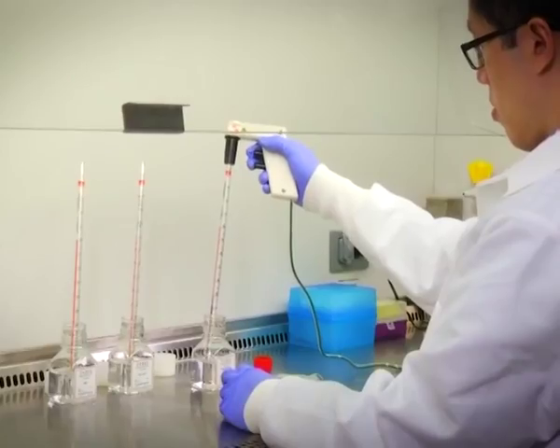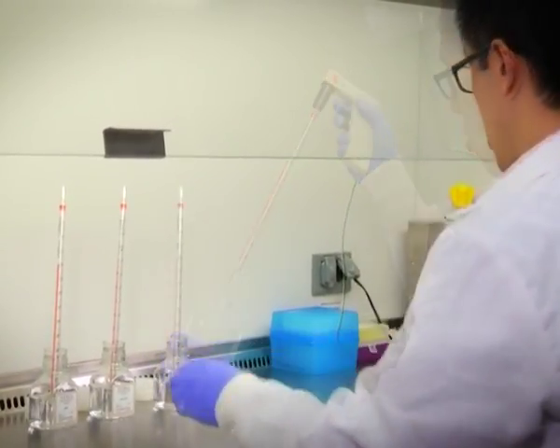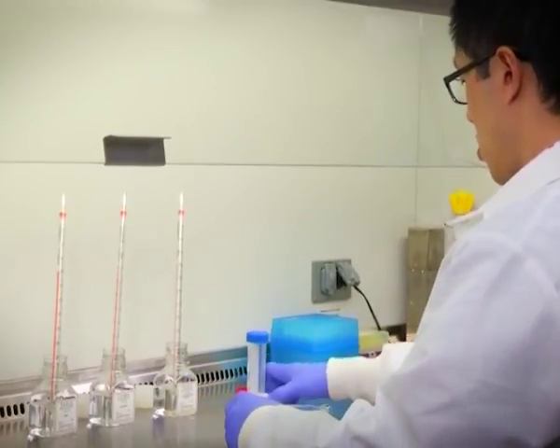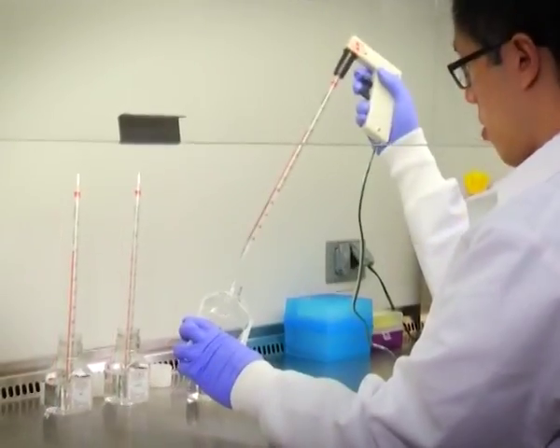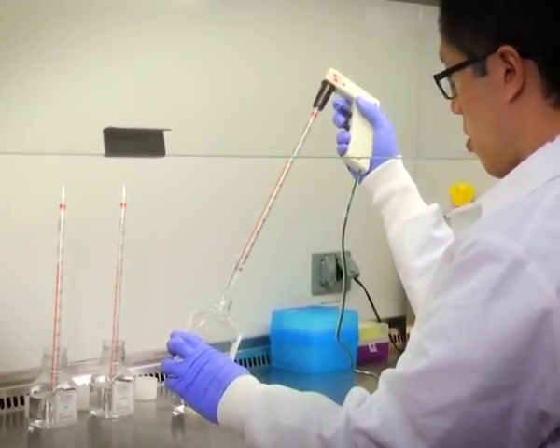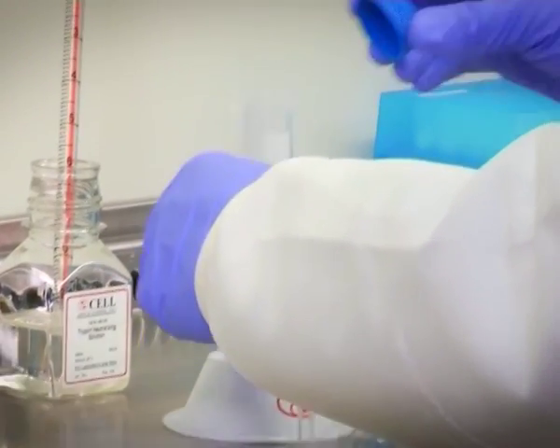Selective medium. A selective medium is one that favors the growth of particular organism or group of organisms. It often suppresses the growth of other organisms. An enrichment culture uses a selective media component to encourage the growth of an organism present in low numbers.